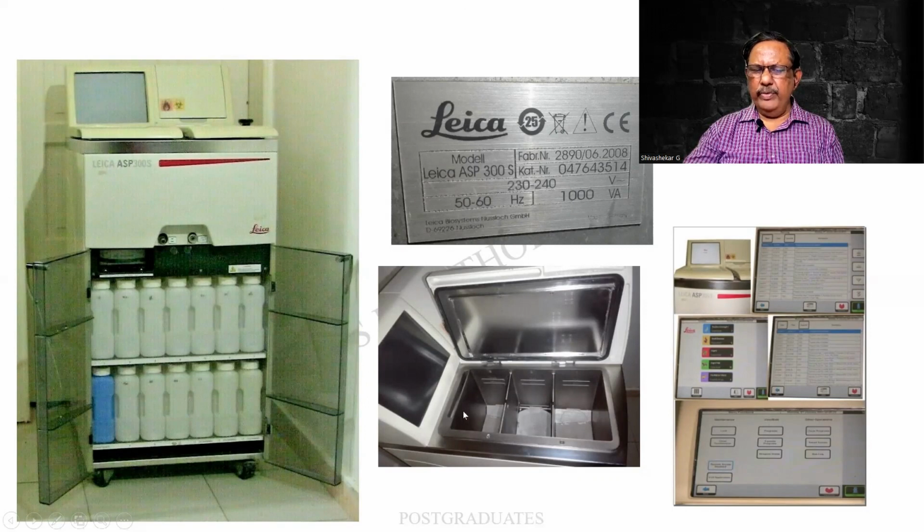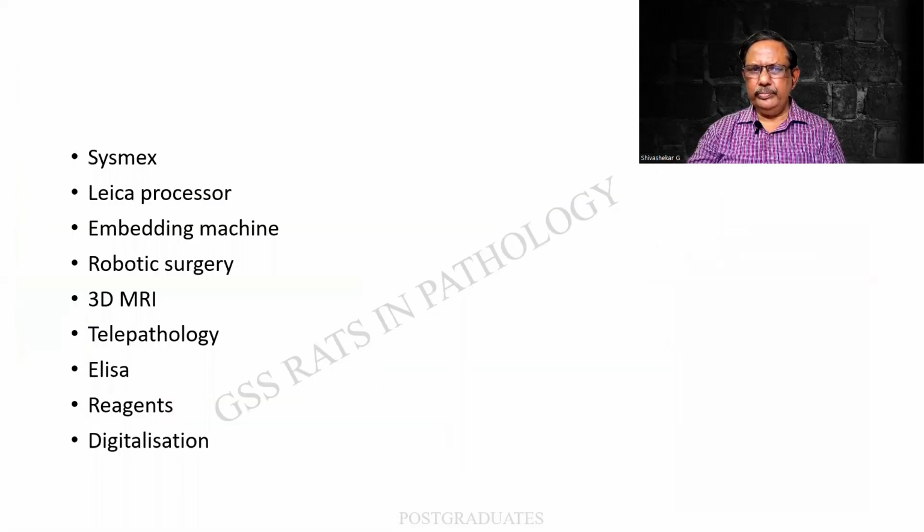There will be 3 parts of it, and depending on the amount, it can be either 1 change, 2, or some institutes insist on 3 changes of wax. And once it is quite old, the first one will be discarded, the other 2 being used. And these are the various monitors, what all you people need, the changes of the timing, etc. can be done, thanks to Leica. Maybe there are other companies over here, but this is my personal experience, and I feel it has stood the test of time.